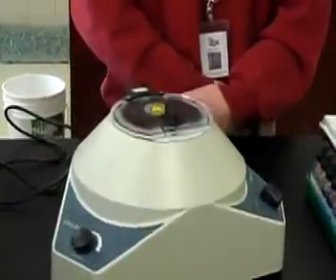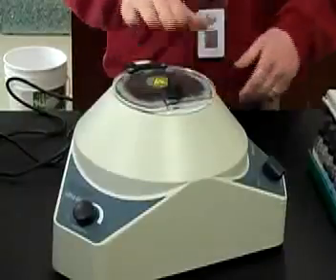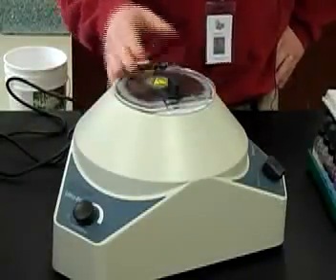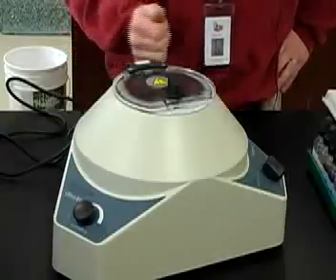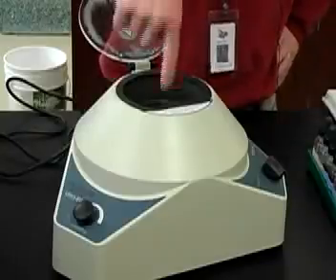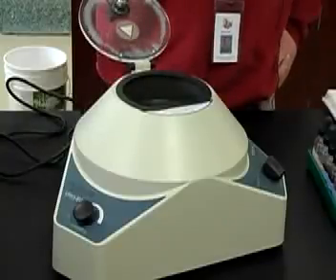Sometimes people do it for longer than that. Make sure that the test tubes stop moving before you open the centrifuge. People, after one day, usually are quite impatient. They'll open the top of the centrifuge, and then they'll start to poke their finger in there to slow the centrifuge down sooner.